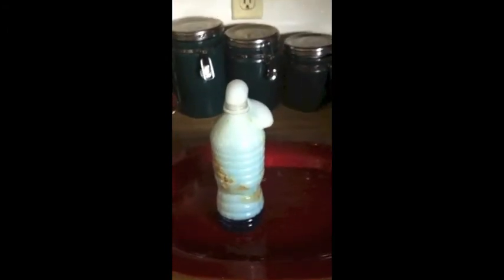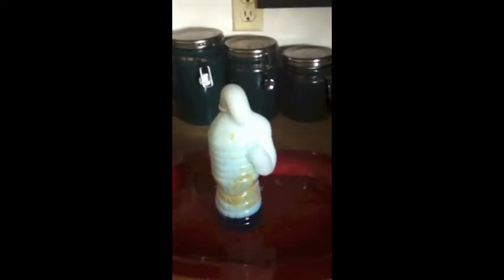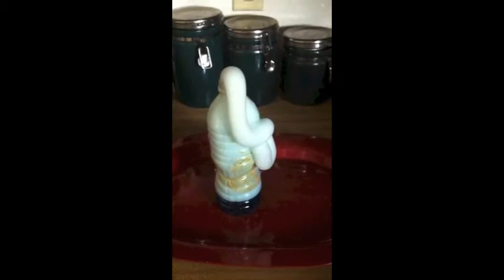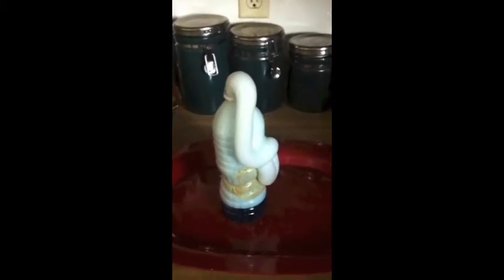Now the dry packet of yeast has risen to the top and it is overflowing and foaming, but it is overflowing and foaming at a very, very slow rate in comparison to the other two trials with the full packet of yeast and water and then with the half packet of yeast and water. But it keeps flowing and overflowing.